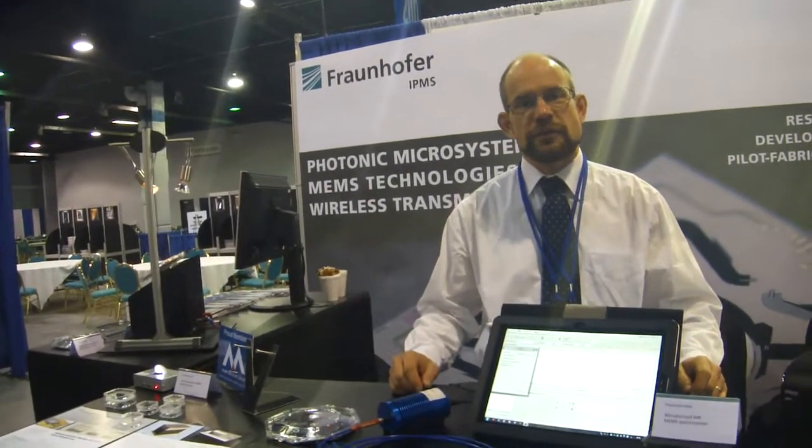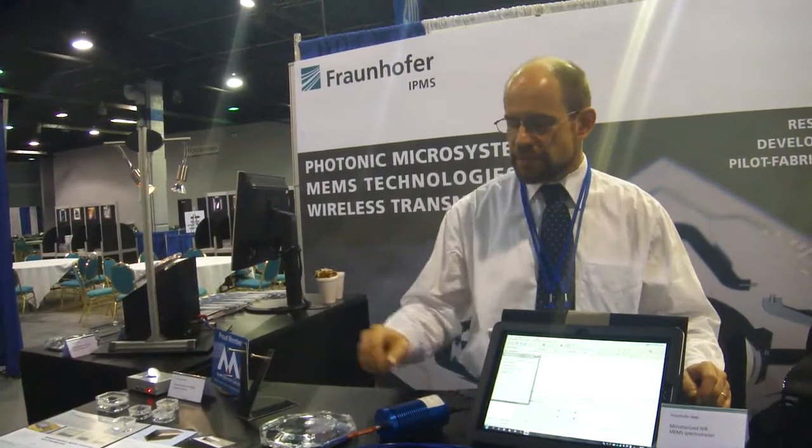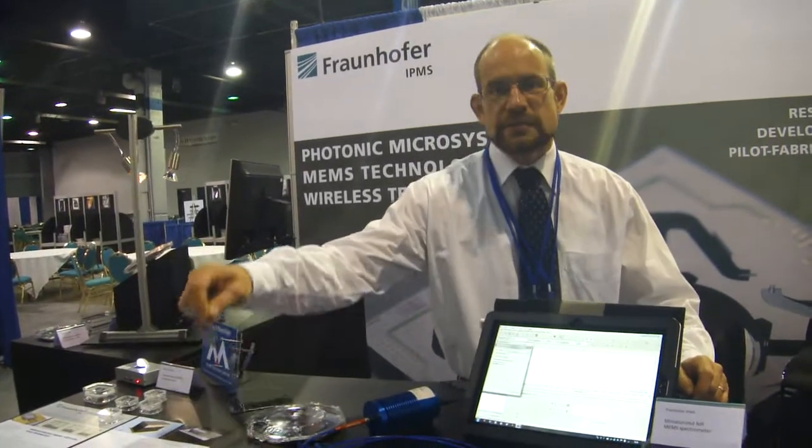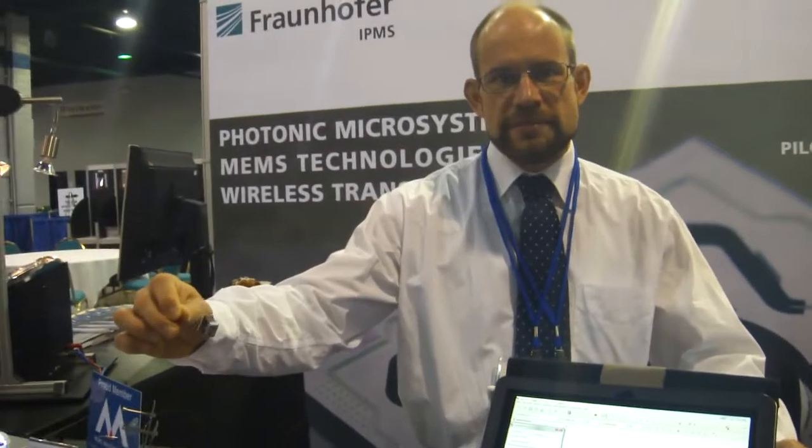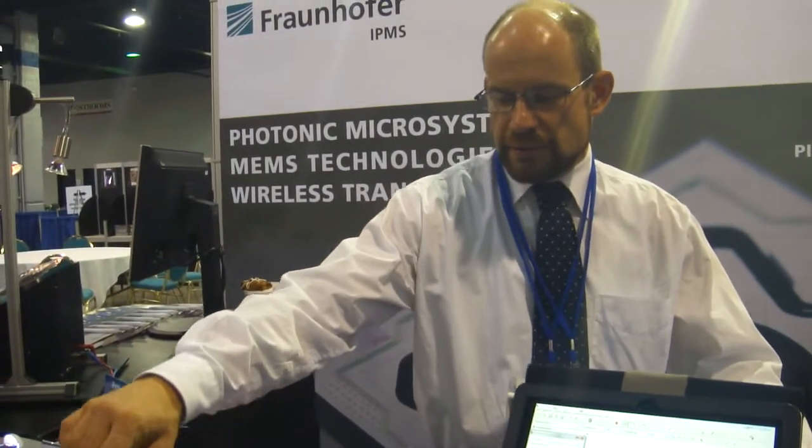Fraunhofer IPMS is showing a MEMS integrated micro-spectrometer. This is the new device we have built — a complete optical bench of a MEMS integrated hybrid fabricated micro-spectrometer capable for the near infrared.